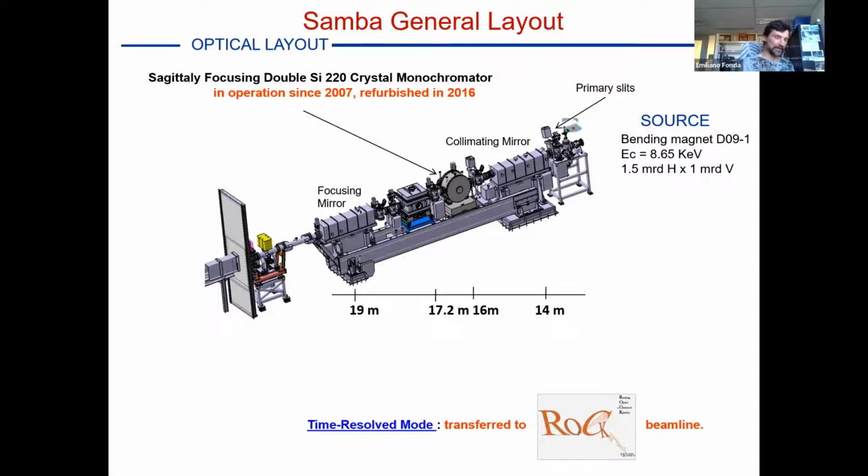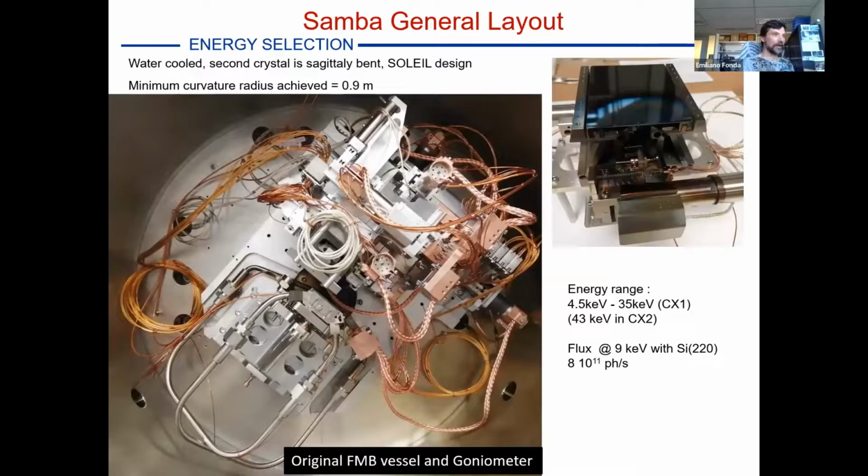And now it's managed by Valérie Bruat. We had to cope for the time being with this sagittal bending monochromator that many of you know as a technique that is very complicated to use for XAS. But finally, we started from an ESRF, Oxford design, and we had to remove everything 2 years ago, and we rebuilt it from scratch at SOLEIL, and we developed a new bender without any ribs on the back, and a completely new mechanics to gain stability and remove vibration.